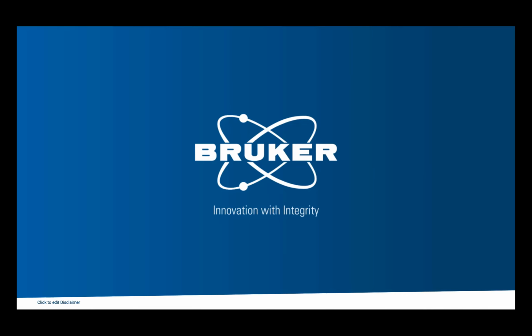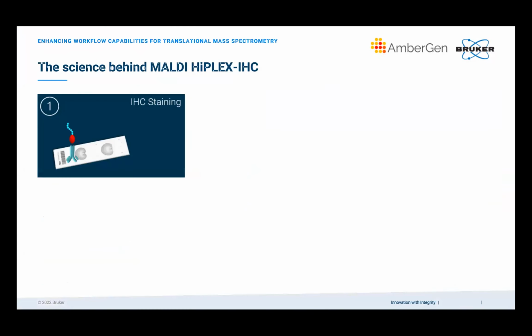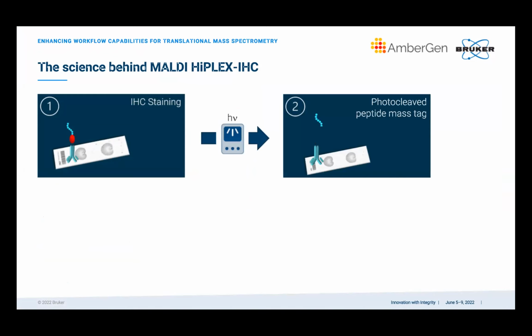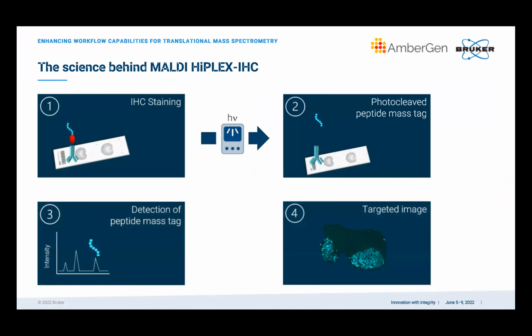And the thing mentioned again, IHC. Yep. So are you hitting the tissue with a laser? It's still a MALDI experiment. Yes. So you're not ablating everything. So your pixel size that you're looking at, you can look at a 100 micron pixel, but maybe you only ablate 10 by 10.